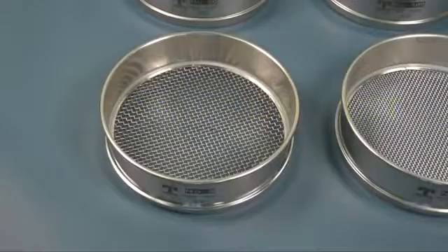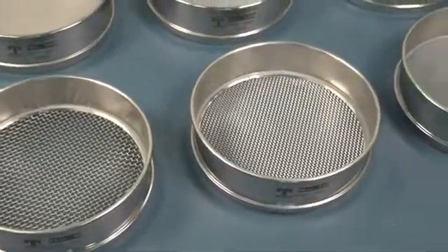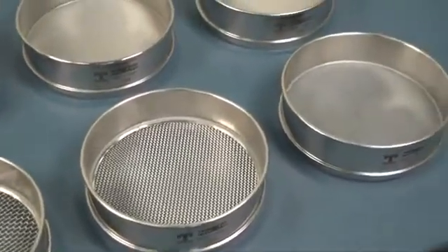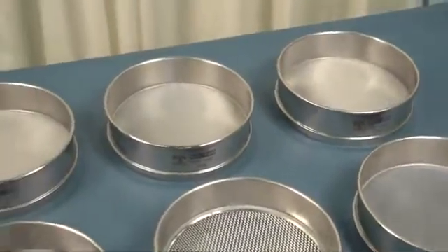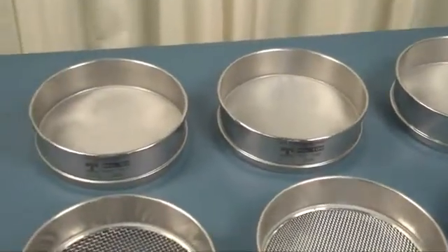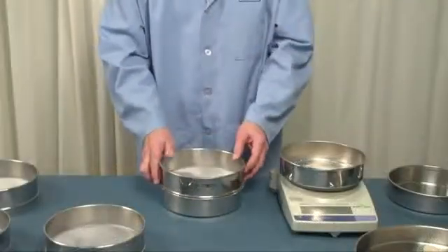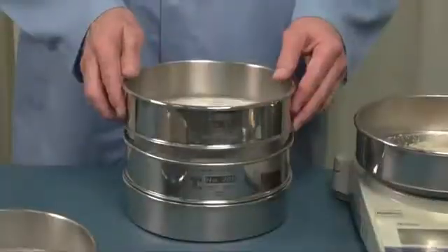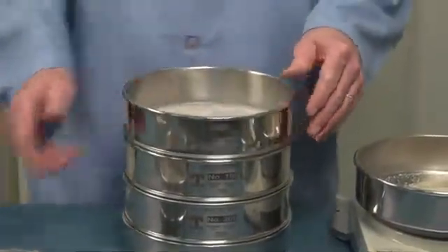Running the test. Particle size analysis can begin after a properly collected sample has been created. Select test sieves from the ASTM or ISO series with mesh apertures that reveal particle distribution at user-defined critical sizes. These are usually stated in a product specification or determined by material processing requirements. Starting with the receiving pan, stack the sieves on top of each other with the finest or smallest opening on the bottom of the stack and proceed in ascending order.